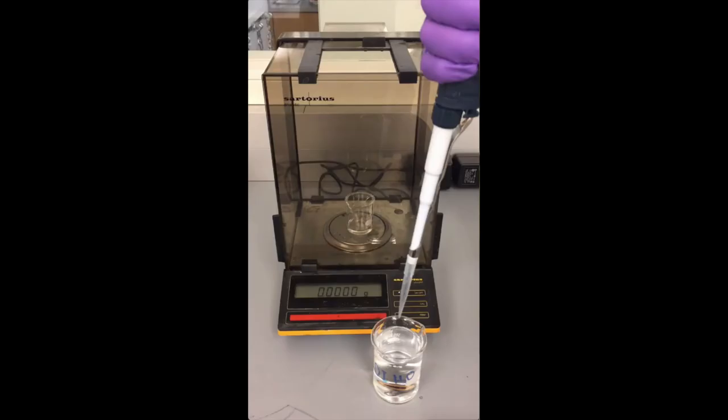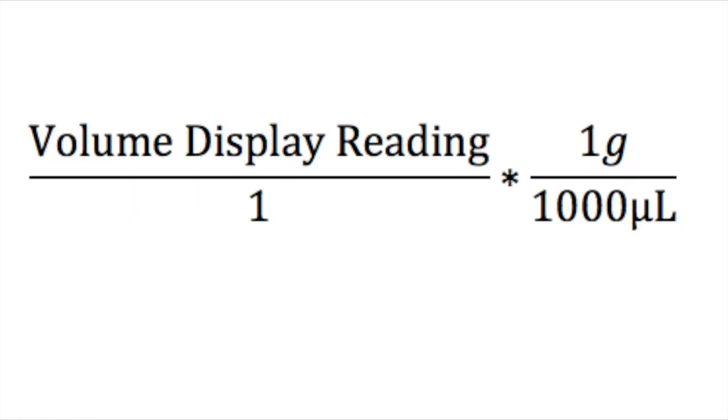In this next section, we will learn how to calibrate a micropipet. We will need a beaker with deionized water, an empty beaker, an analytical balance, and of course, your micropipet. For this next part, you will need the following conversion.